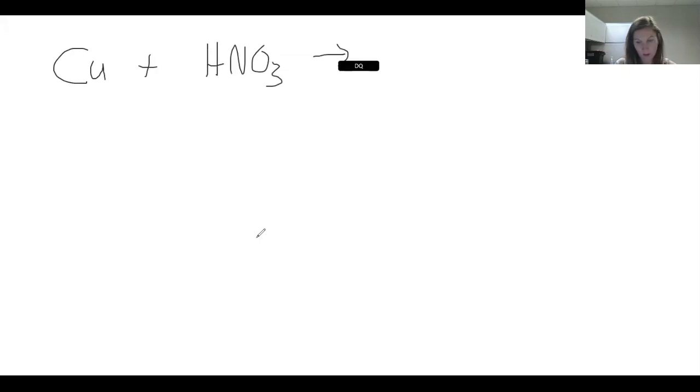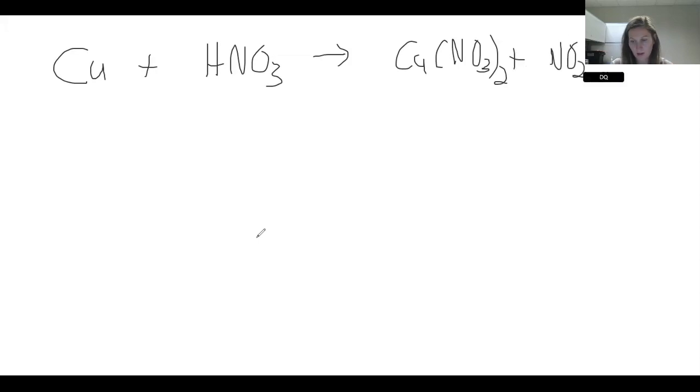So reaction 1 is where we took the solid copper wire. In the video that we saw, it wasn't a copper wire, it was copper turnings, little solid pieces of copper. So copper with nitric acid, and it formed copper 2 nitrate. Once again, sorry for the sloppy writing, it is a touch screen. Nitrogen dioxide gas, not really leaving a lot of room for it. Water.